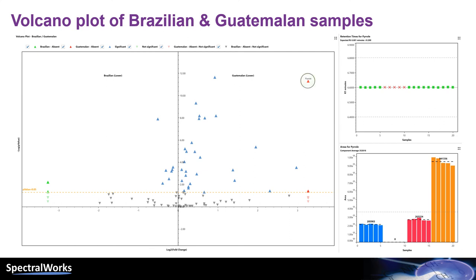Take, for example, Pyrrole. When present, the retention time of the component was stable over the dataset. Over the five Brazilian samples in the bar graph, Pyrrole was found and was relatively consistent. In the Guatemalan samples, we can easily see that Pyrrole did not exist. This is indicated by the red crosses in the RT display and the lack of data in the bar graph.